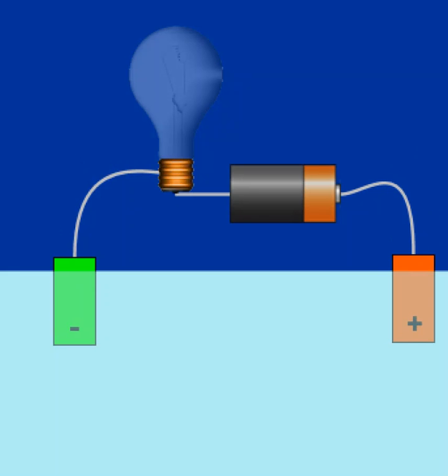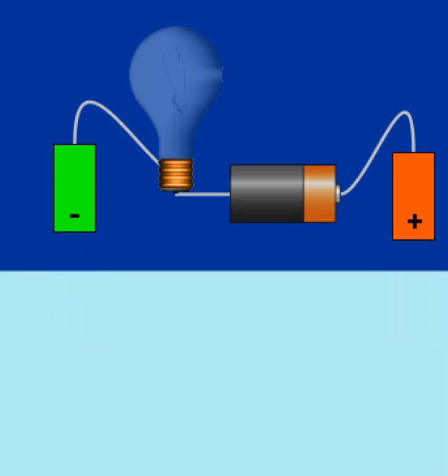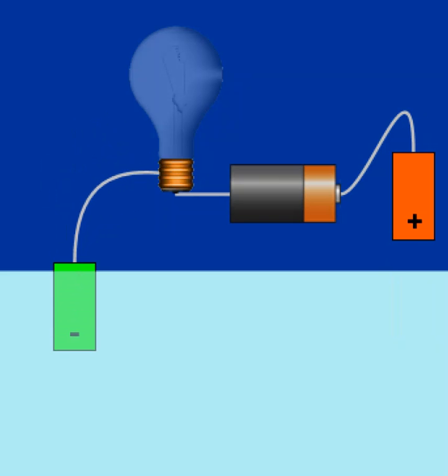Let's look at what happens with tap water. Now, distilled water theoretically is pure water. Tap water has something in it. So what do you think tap water will do? Okay, I've got my tap water now. Let's see what it does.